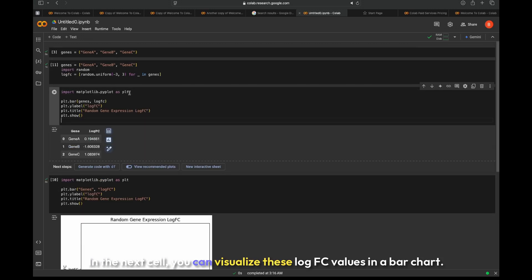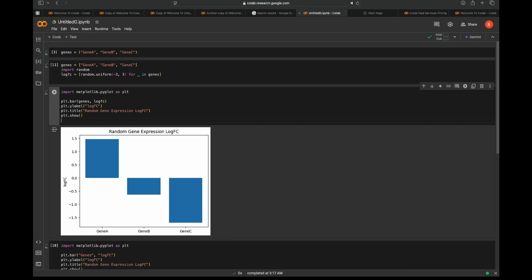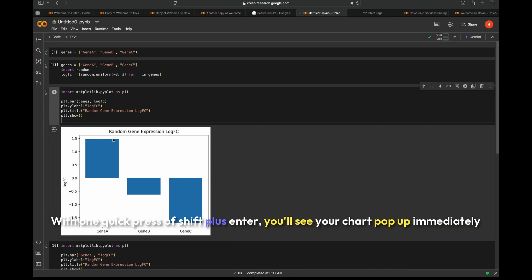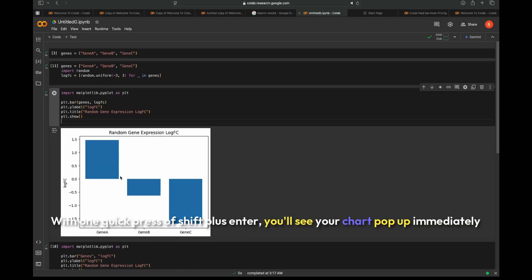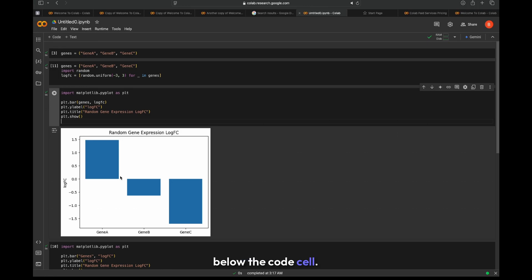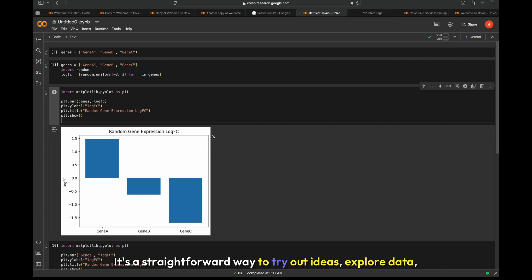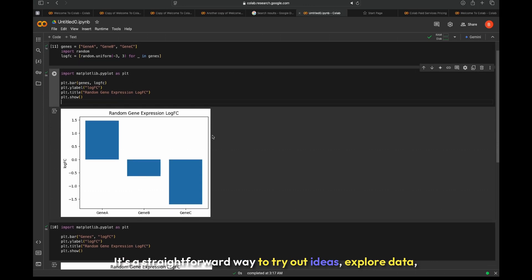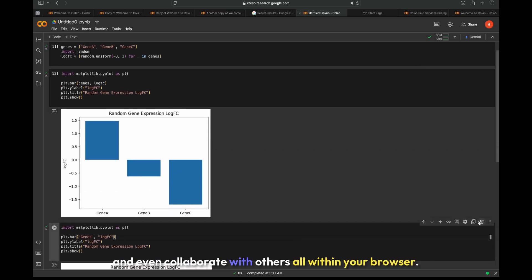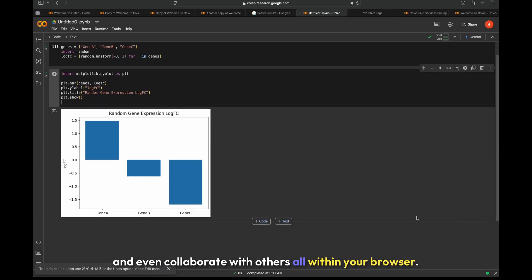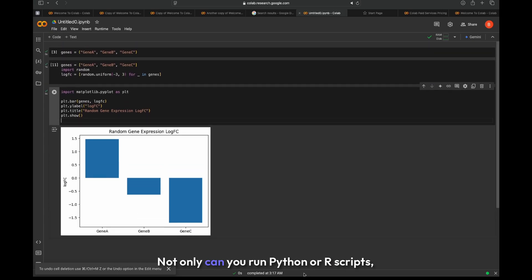In the next cell, you can visualize these logFC values in a bar chart. With one quick press of Shift+Enter, you'll see your chart pop up immediately below the code cell. No local setup or installs required. It's a straightforward way to try out ideas, explore data, and even collaborate with others, all within your browser.